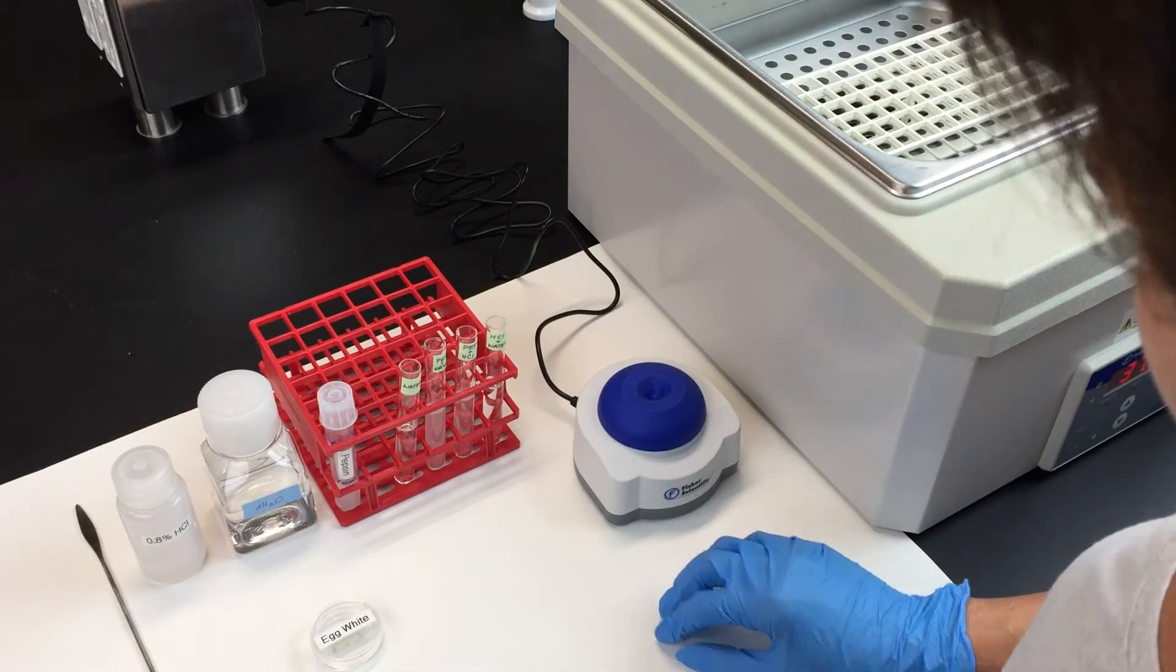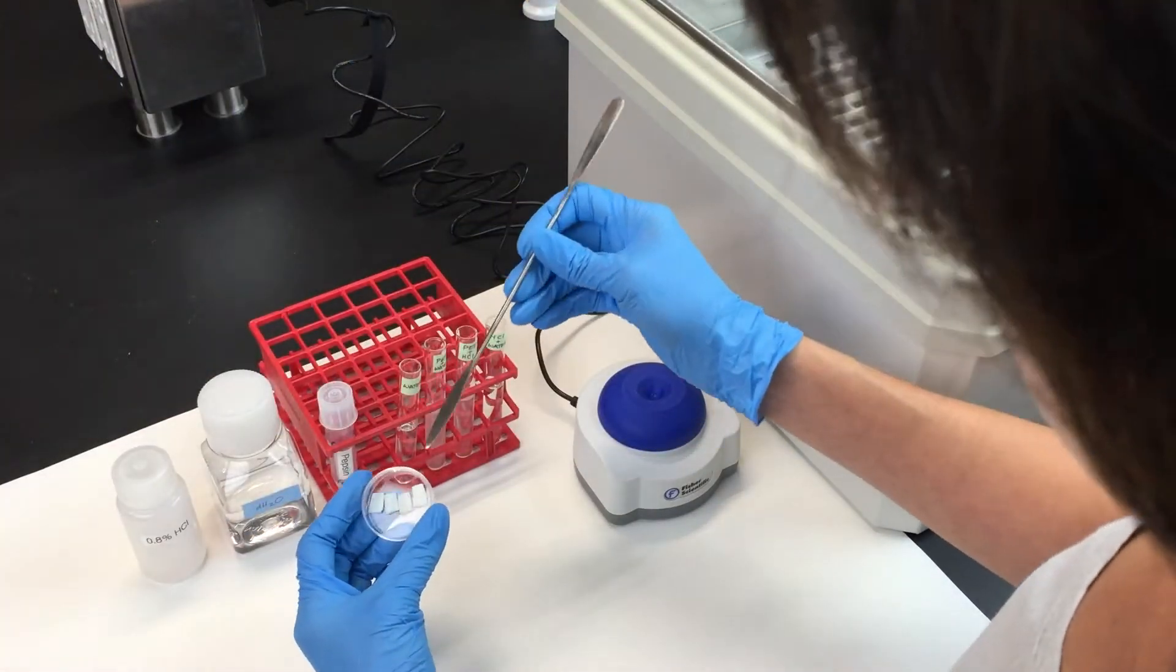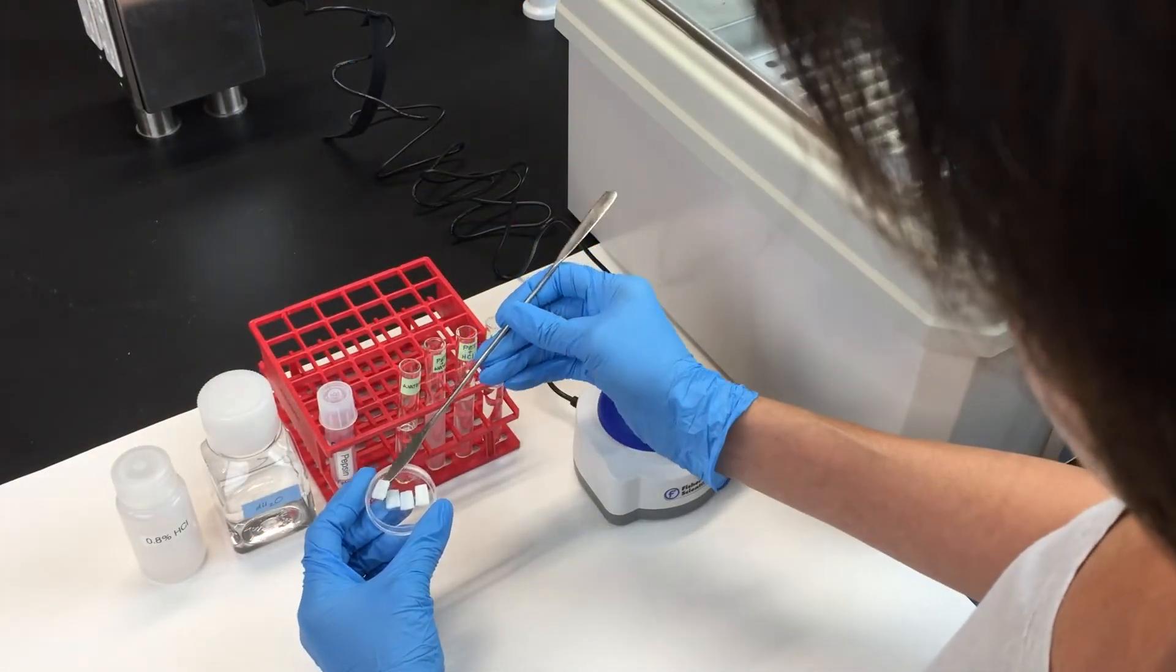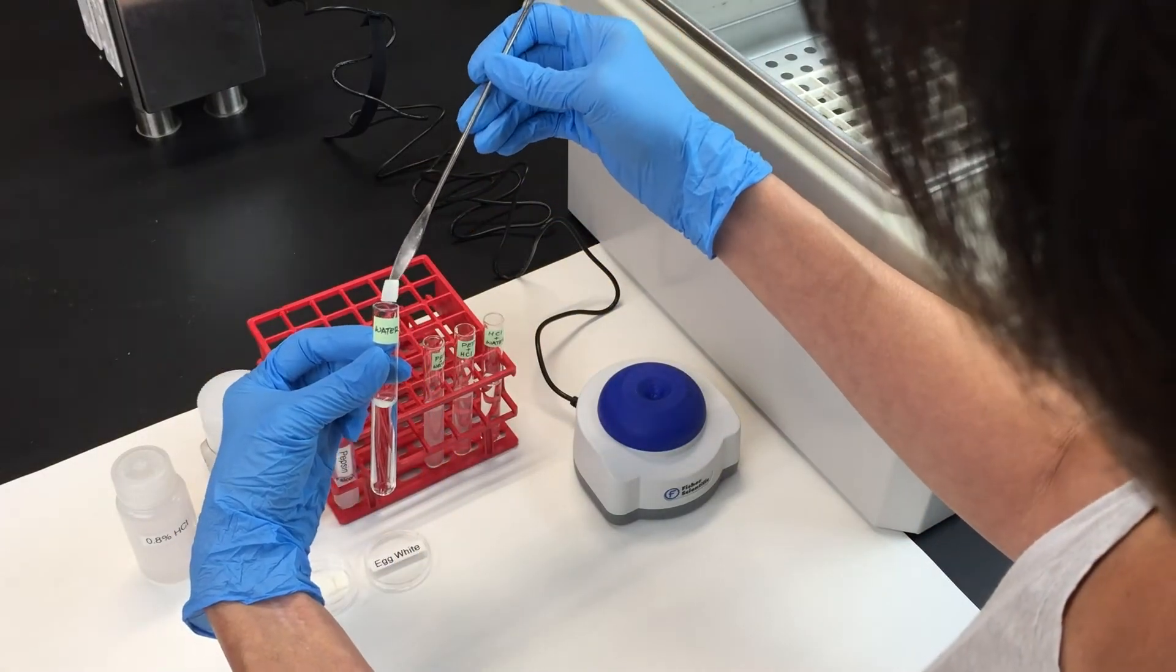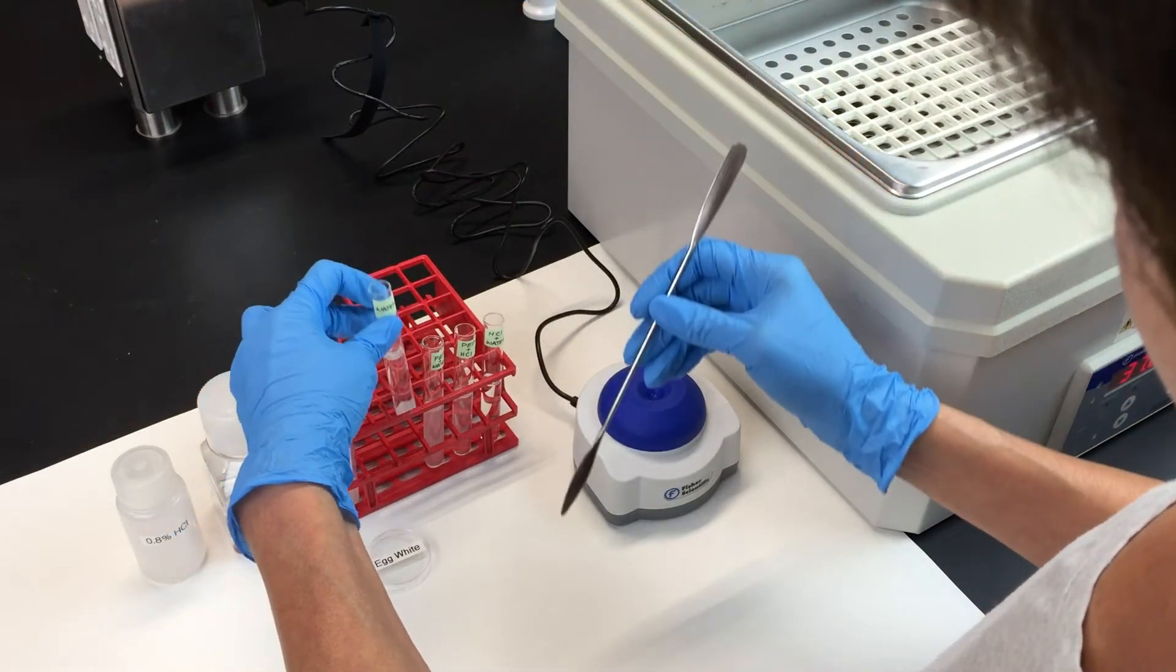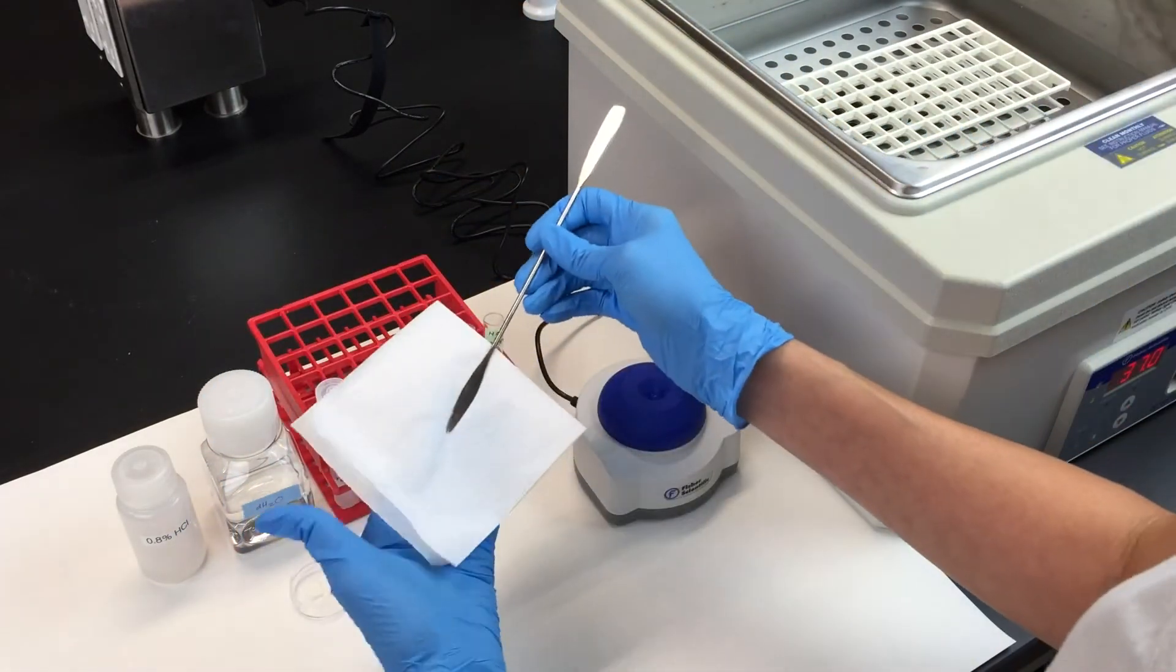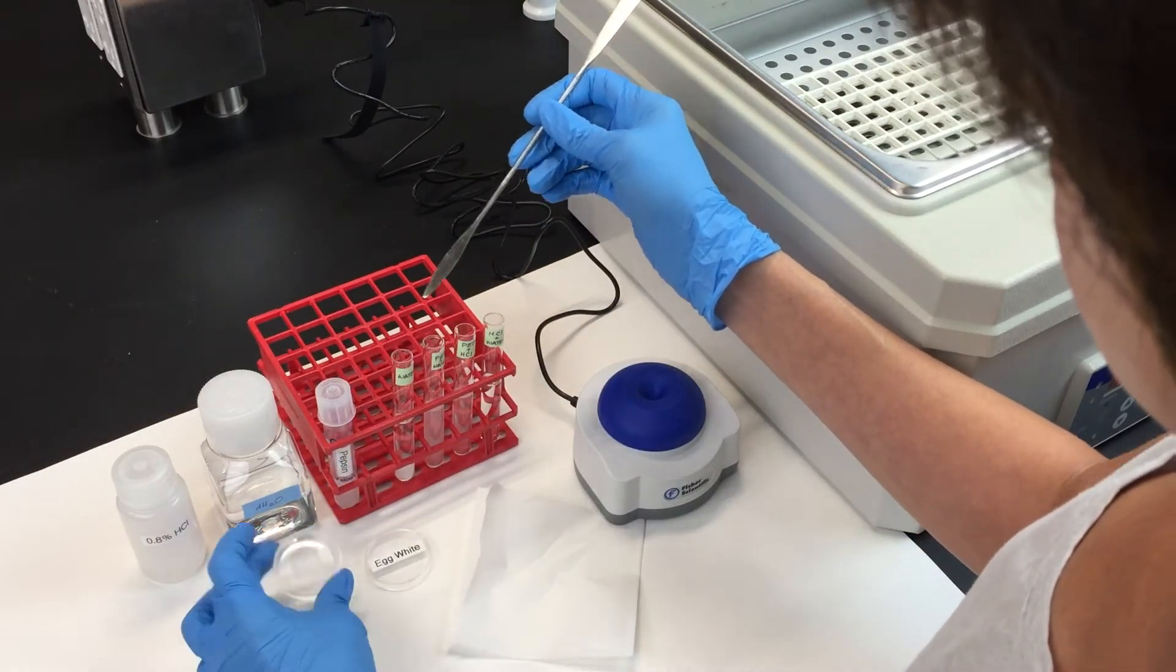Using the spatula provided, carefully add a slice of egg white to each tube. Make sure that the egg white is fully submerged in the solution. You should also wipe off the spatula in between tubes so that you don't contaminate the tubes.